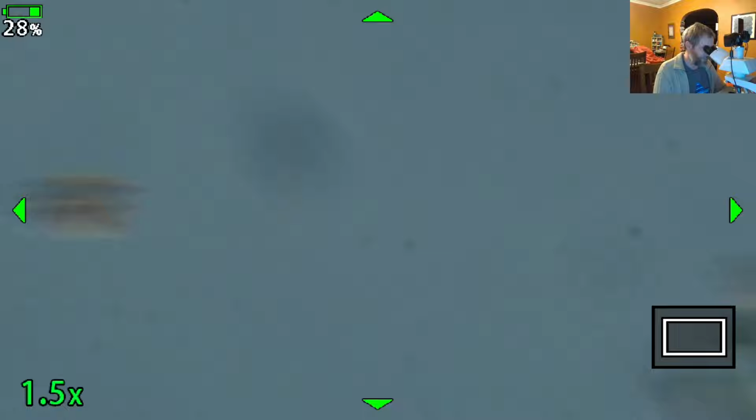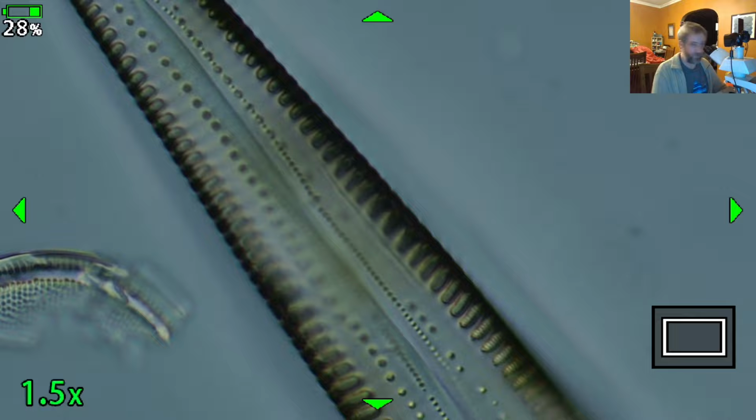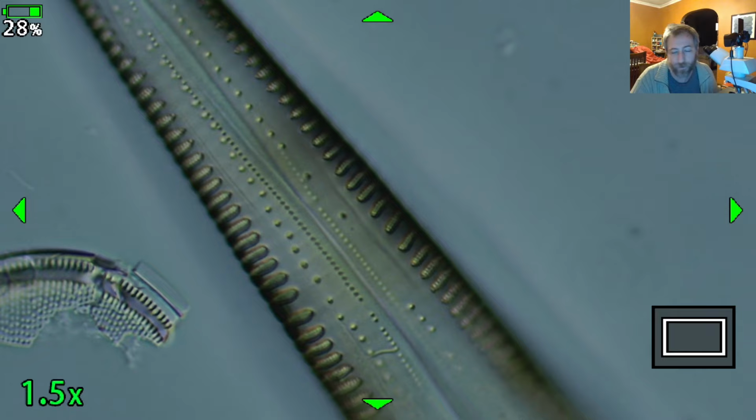Hey, here's that giant Gomphonema again. I think maybe it's the same one. I think I've circled back around to the same giant Gomphonema that we saw earlier. This is the monster that I was looking for. So that's what I would recommend for a microscope setting. I think it's actually really nice.